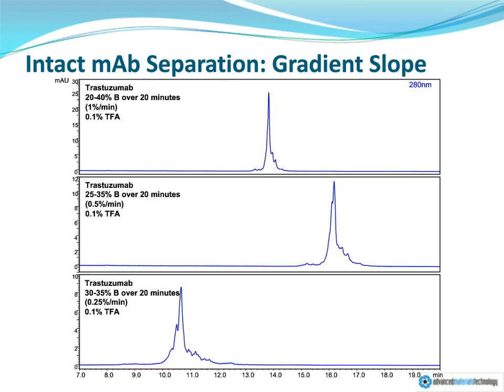Now, we need to be careful when we look at intact protein separations, because in addition to the variants that we know are present in intact proteins, that is, potential N-linked glycosylation variants and chemical modification variants, or maybe even sequence modification variants, if we manipulate the operational conditions without some caution, we could run into what I believe to be the problem looking at this comparison of conditions.